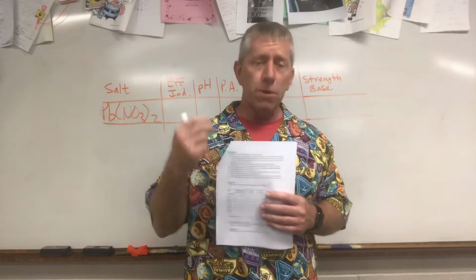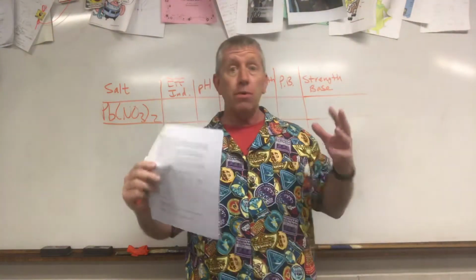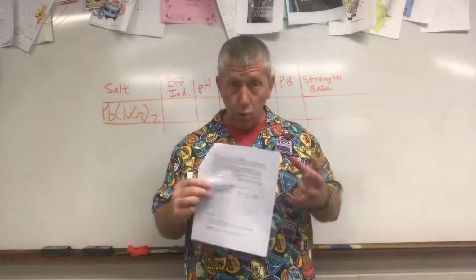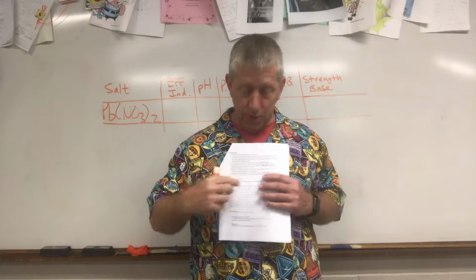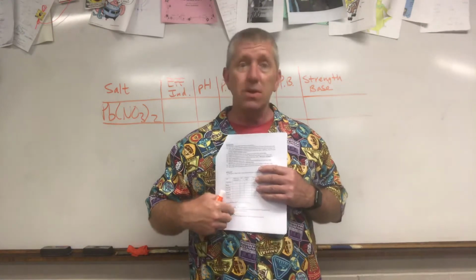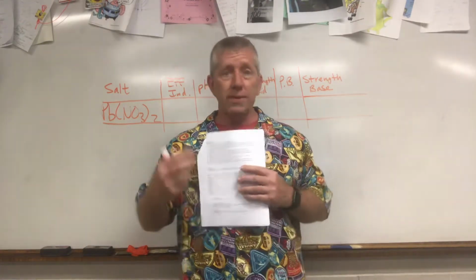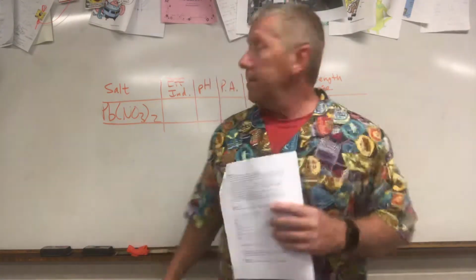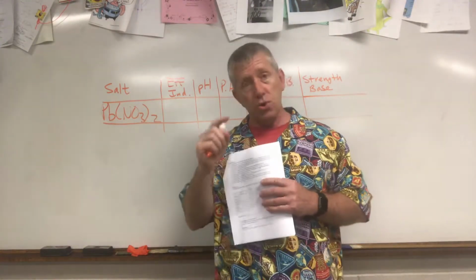No equipment here. So what you would do, if we were together, is make a solution. The whole class would act as one lab group for this lab. So each group, I would usually break you up into groups of 2, would make one of these salts. Otherwise, if you make all 7, it takes a long time, and everybody's doing the same thing repeatedly. So we work as a group, and for example, you and I, lab partner, might have the lead nitrate solution to make, and we'd go ahead and do that. And I'll show you how to do that.